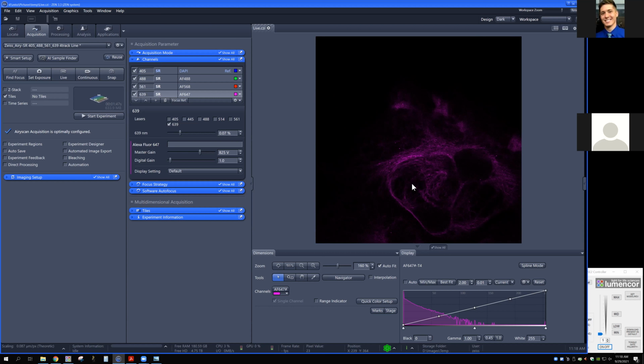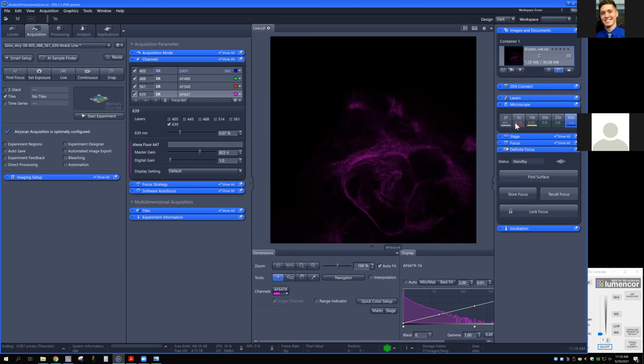You can do Airyscan with every single one of the objectives that we have here, honestly. It's kind of a waste to do it with the 5X, but for the 25X, you get gorgeous images. For the 20X, the sensitivity that you can achieve with this is absolutely phenomenal. And even for the 10X, you can see some improvements. Now, you're not getting super resolution, of course, because these can't resolve that well anyway. But you are improving the resolution and you are getting much better sensitivity also.